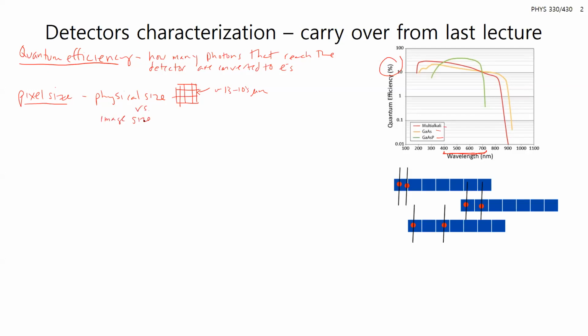So after the image that's being projected from your sample goes through all the lenses and the magnification and so on, what's the image? One pixel in your image that you're detecting, what is that at your sample? So this should be typically 10s to hundreds of nanometers. It can be larger, it's really dependent on your magnification.